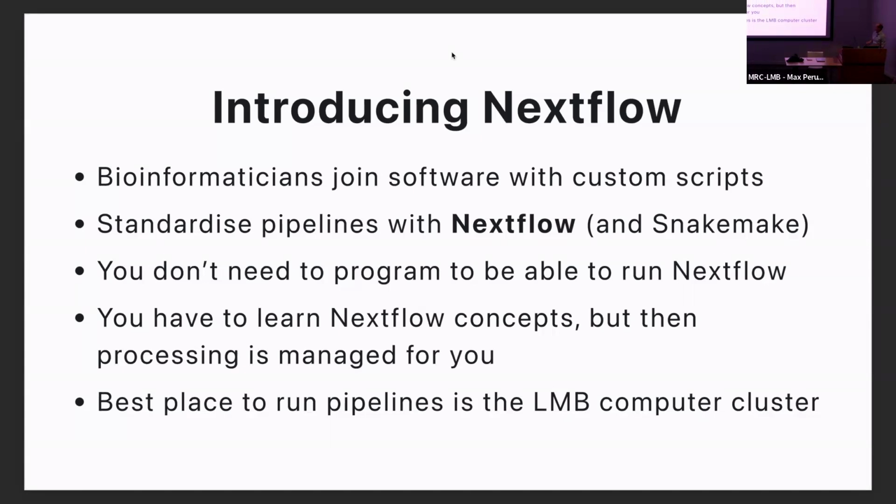So people ask, once this is set up, where is the best place to run a pipeline? At the LMB, I noticed quite a few people do try and do some analysis themselves on their Macs or on their PCs. I know people have got nice, expensive Macs and they're quite powerful. Really, the best place to do it, however, is on the computer cluster. So we've got a high performance machine at the LMB that's managed by Scientific Computing.